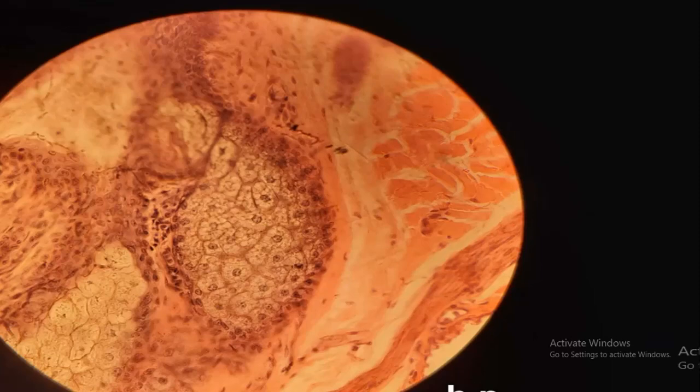So this is just the scalp, and in this slide we are just projecting the area of interest, which is the sebaceous gland having a cluster of nuclei, and this cluster of nuclei is a cluster of cells, and this cluster of cells has prominent nuclei which have been stained by H and E.